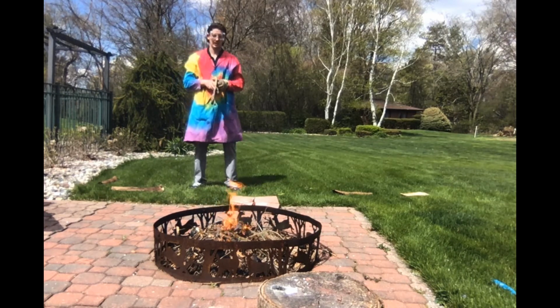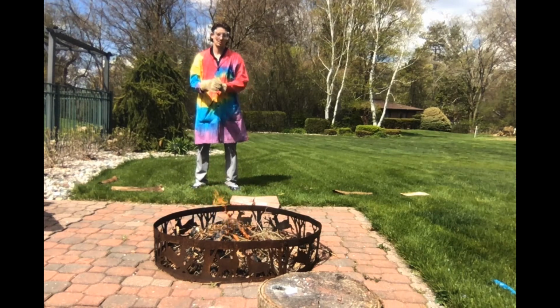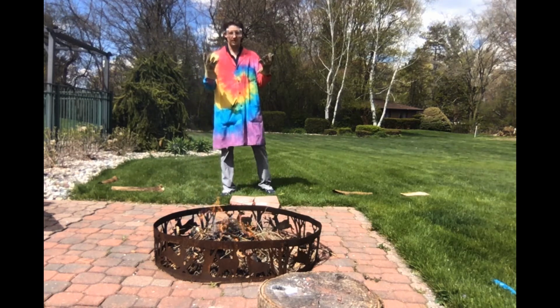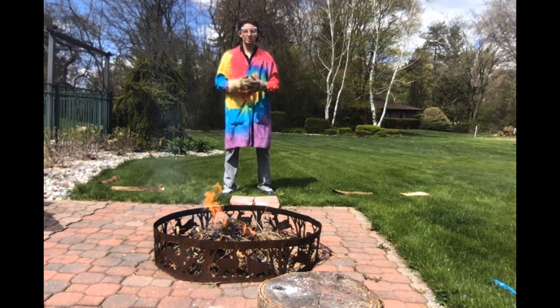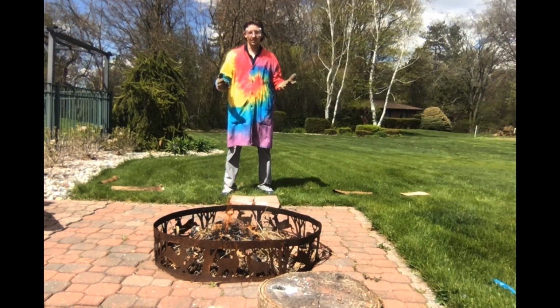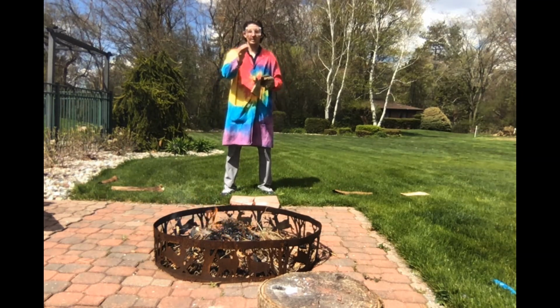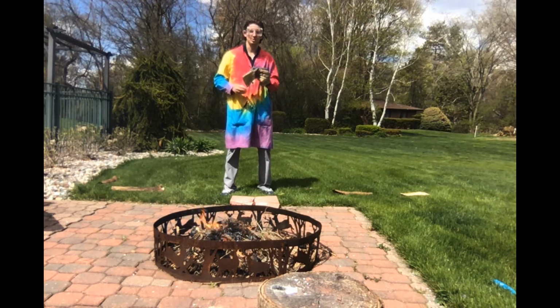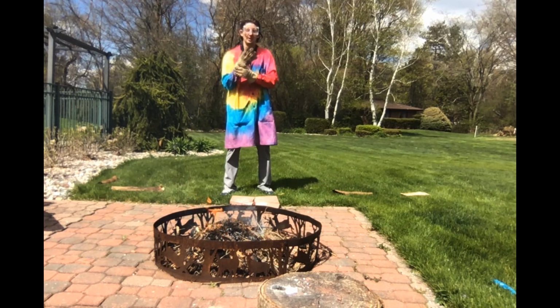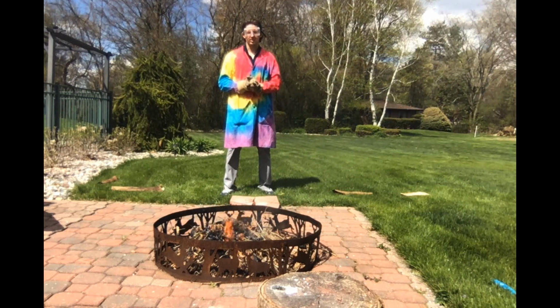Having the proper safety gear can really save your life. Currently, I have this lab coat on to protect my clothes from any chemicals, and it also adds another layer of defense. I wear these gloves when I'm working with chemicals so that they don't get on my skin. These goggles protect my eyes so that I can see for the rest of my life. And I'm also wearing ear plugs. I left my heavy duty ones at school, so it protects my ears and my hearing from loud noises. All right, thank you, and be prepared for the demonstrations.